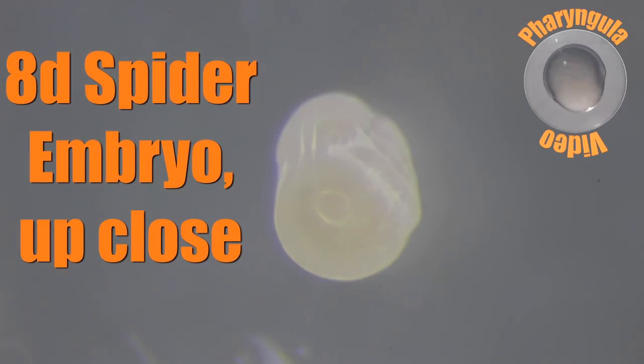Okay, this is pretty cool. This is a spider, a spider embryo, eight days after its egg was laid.